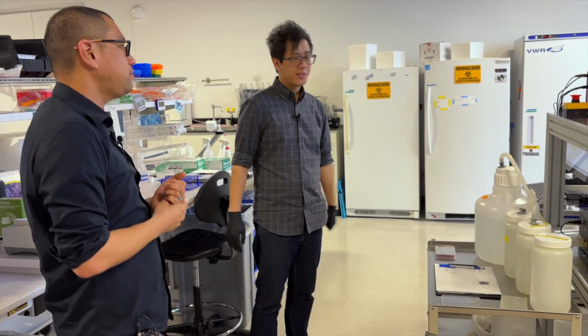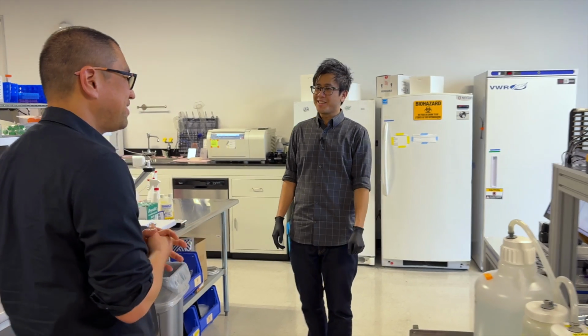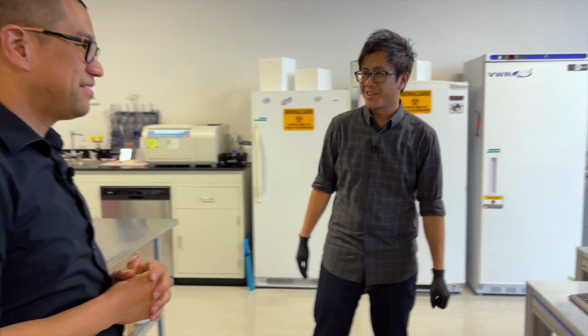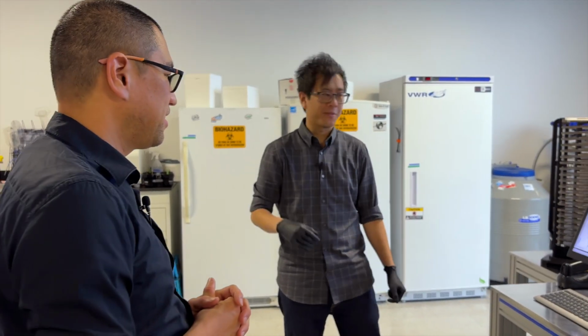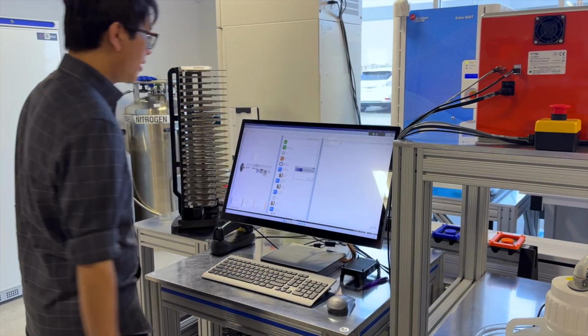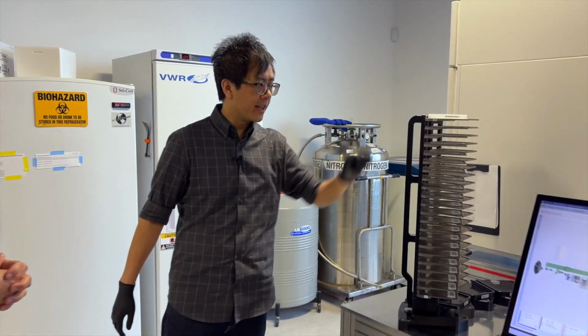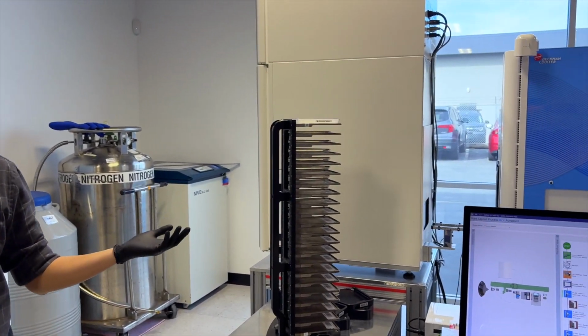And we can even make the robots move a little bit. We have a typical test suite that we'll run. Just like in software engineering, you want test suites for hardware as well, just to make sure that all of your teach points are correct for your arm. So I can go ahead and kick off something like that. What you're going to see here is our robot arm is going to pick up this test plate that we have with a lid, and then move it through some of our most common motions.